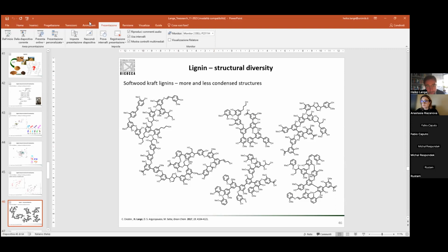To be honest, it's not the author, the professor, the group leader has the publication, and then he has an online repository where he has the sequences. Okay. So you take the basics of the sequence from his website, and then you adapt it to the specifics of your instrument, obviously. Yeah, exactly. You need to be able to program the NMR. But he doesn't provide a Bruker pulse sequence, because then I could just quickly adapt it. Maybe even he has parameters.